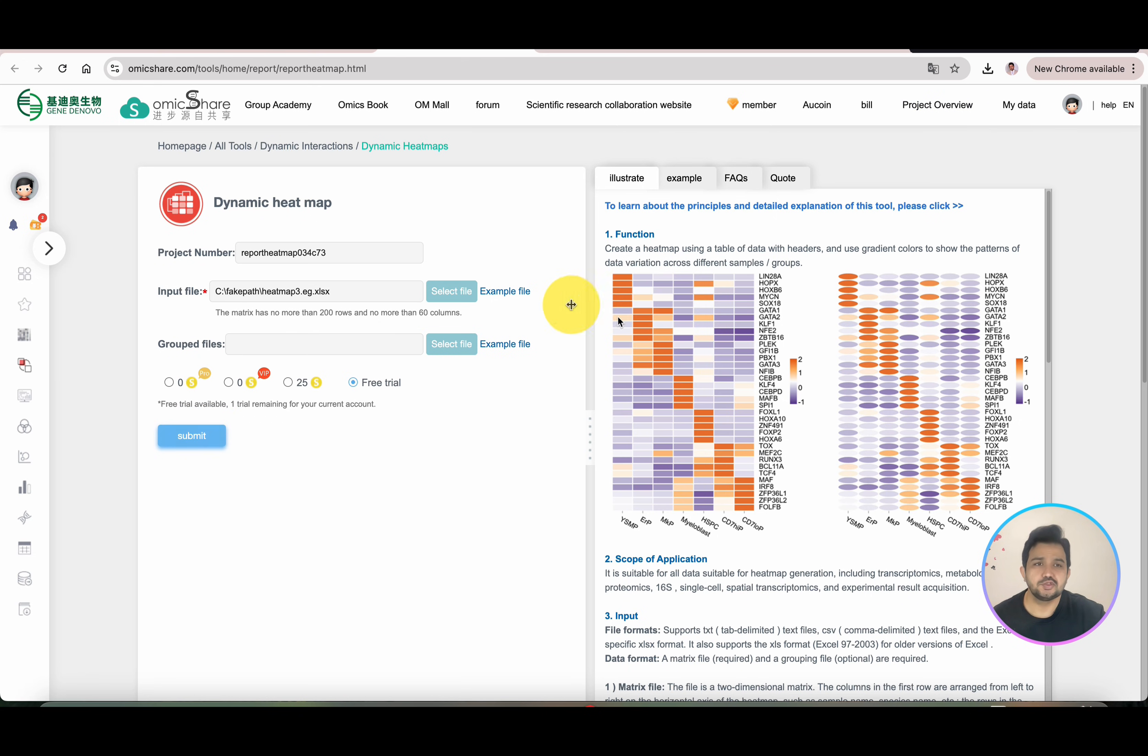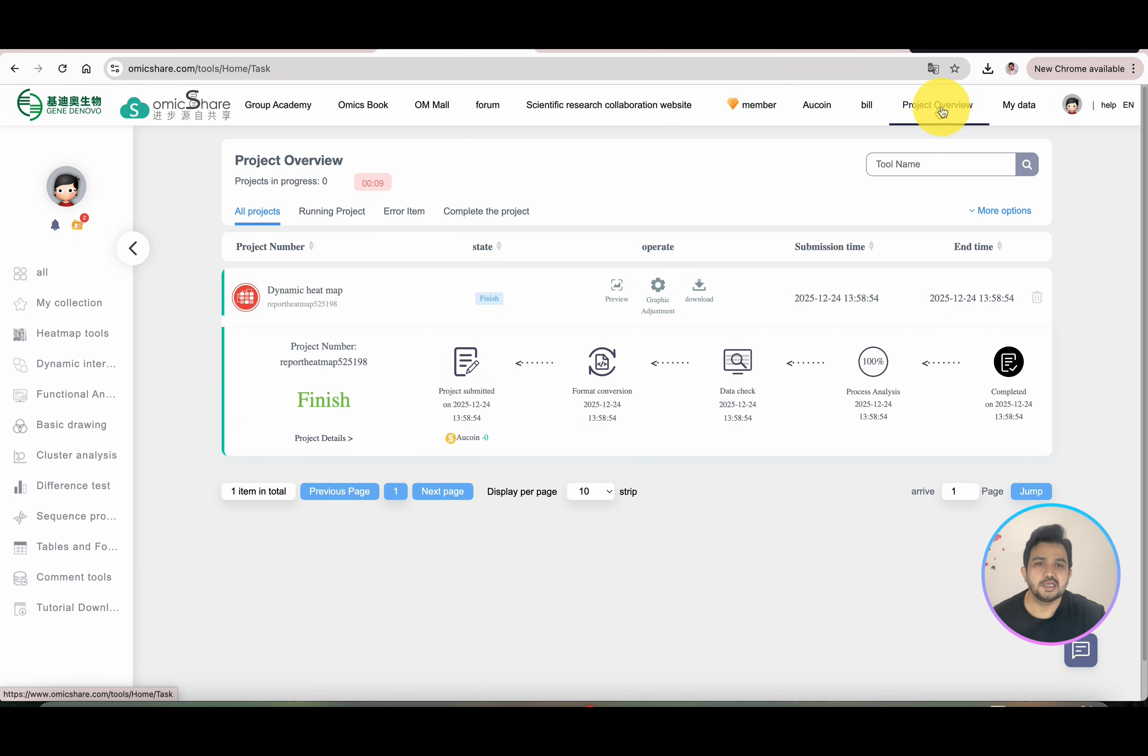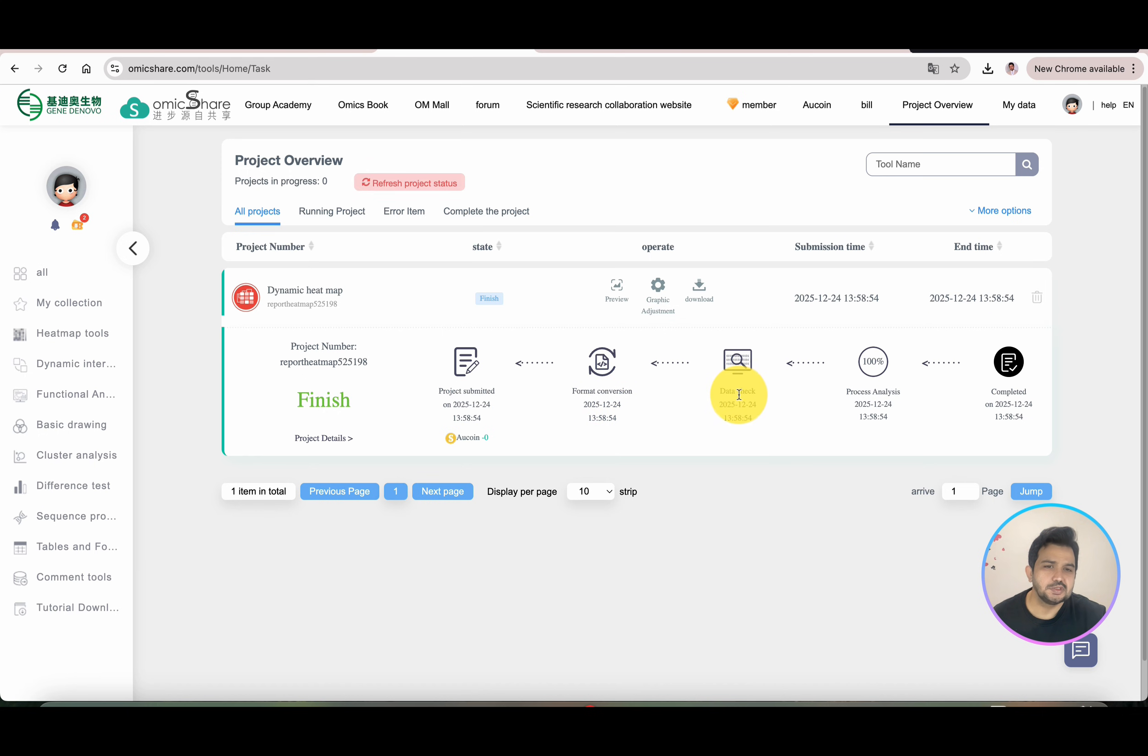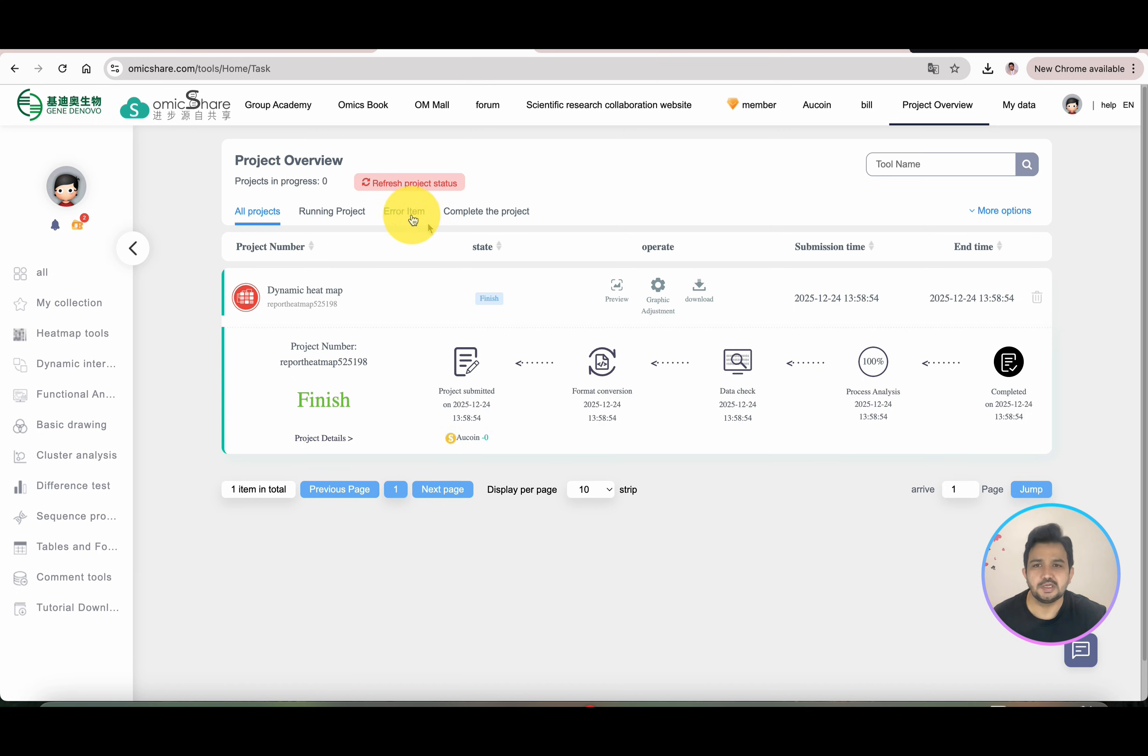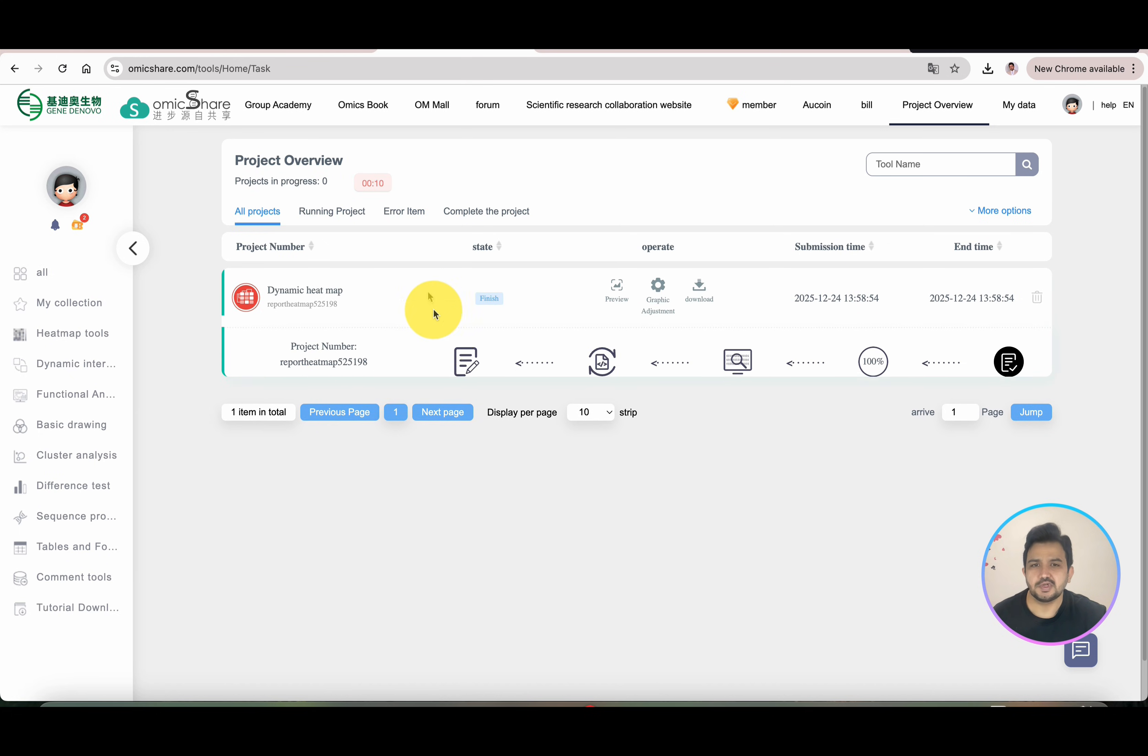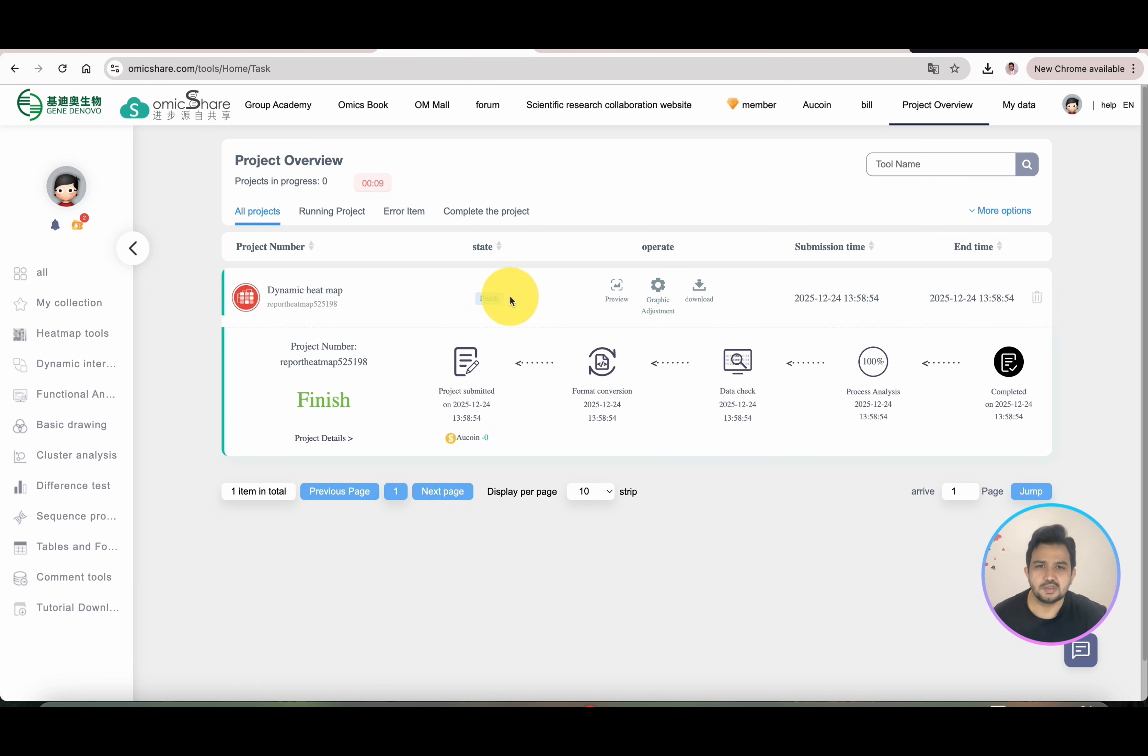After you submit, your project will come under the heading of Project Overview. You can see the project we just submitted is now going through format conversion, then data check, then process data analysis, and completed. We can simply refresh its status. You can see this status is already finished.